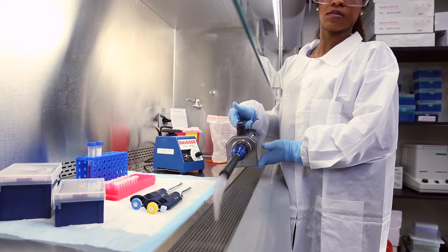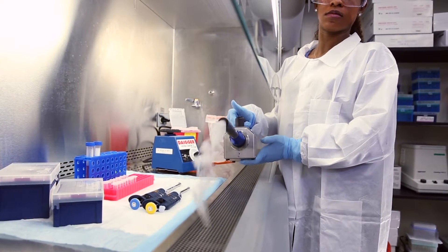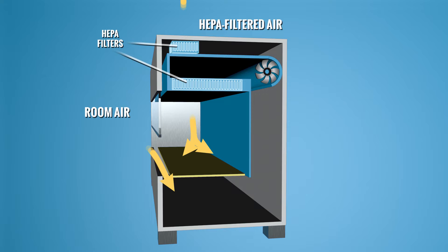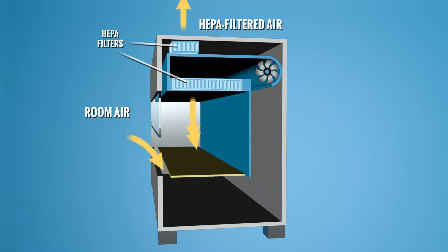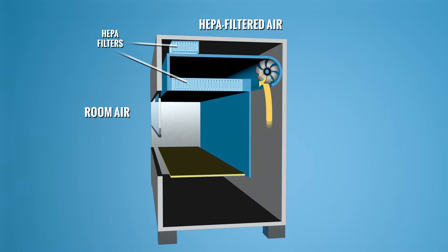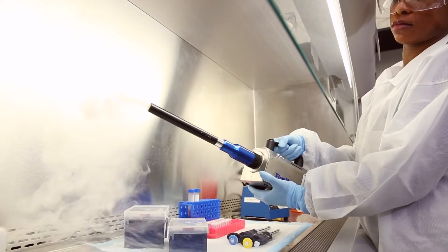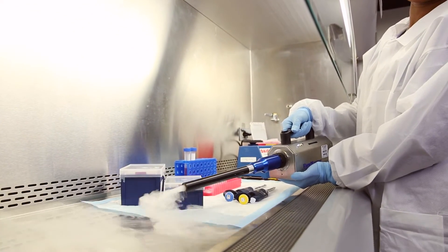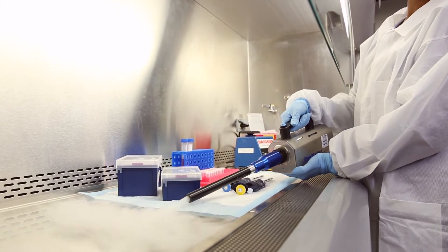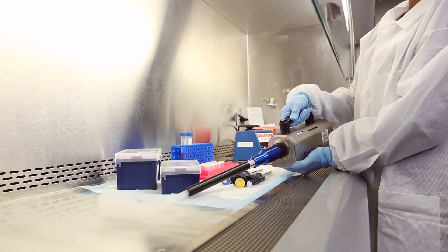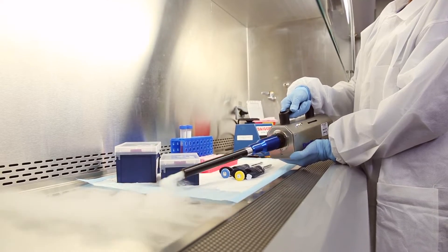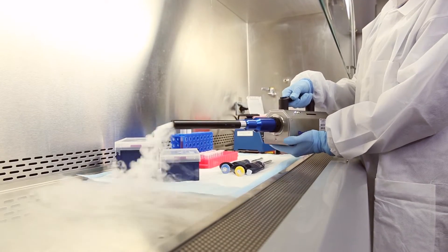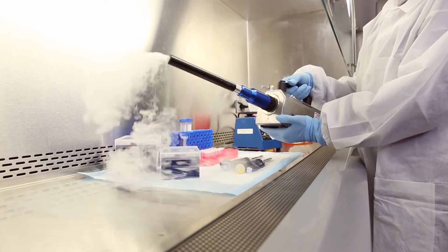To protect the work product, the cabinet's downward air is cleaned by a high efficiency filter within the cabinet. Upon reaching the work surface, roughly half of the downflow air moves toward the front grill and the other half moves toward the back grill.